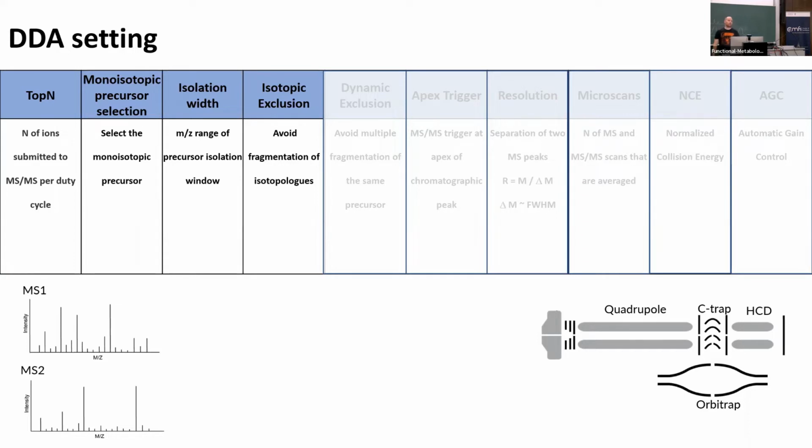I don't know. The one we have, you can select that. I don't know about Waters. So I think most instruments you would do proteomics with, they probably have a setting like that.